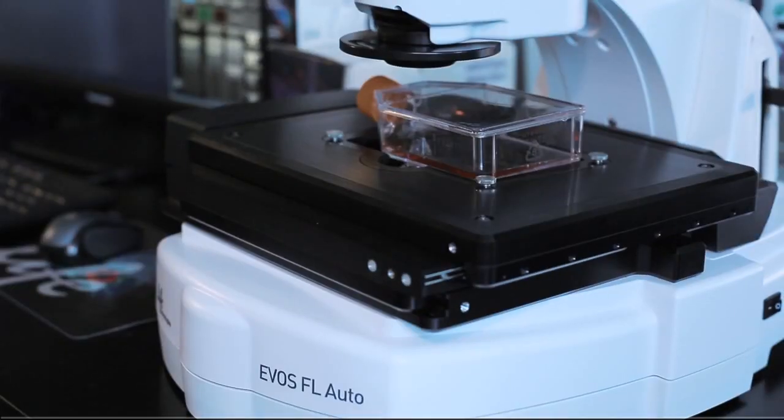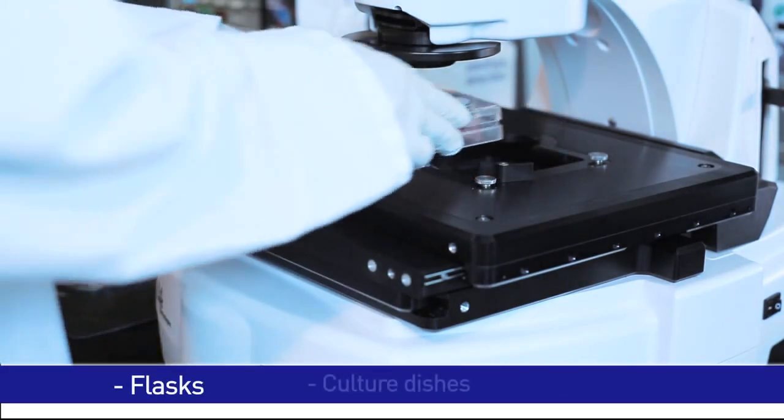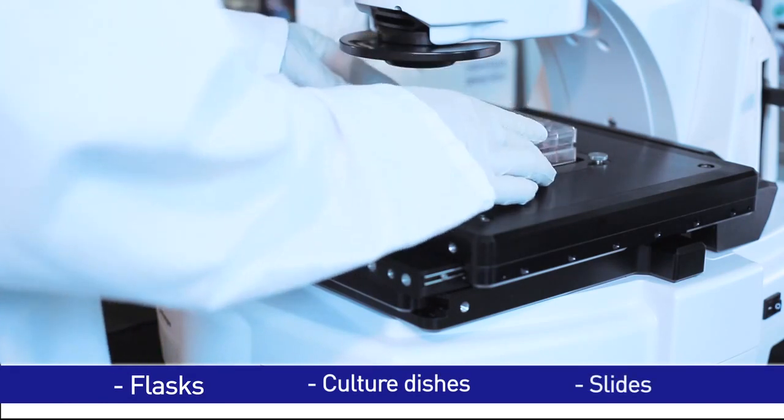A wide variety of vessels can be used for imaging on the EVOS FL Auto. Vessel holders are available for flasks, multi-chamber cell culture dishes, and microscope slides.